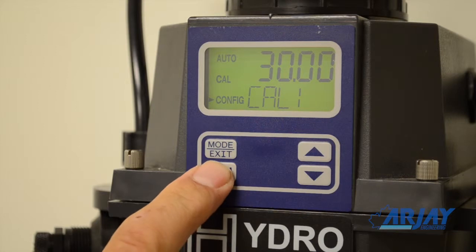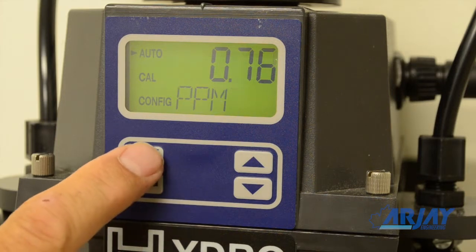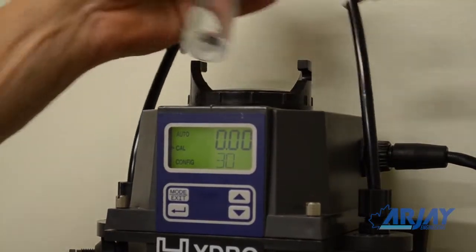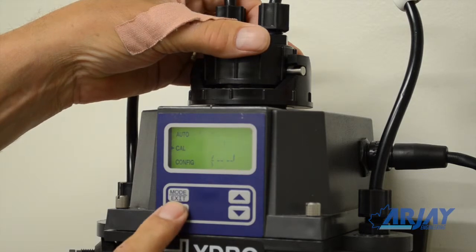First, determine what 2 or 3 ppm values are being used for calibration and enter these into the setup mode of the instrument. A 0 ppm reading can be one of the calibration points. With the calibration samples prepared, enter the calibration mode and proceed to the automatic calibration screen. Follow the prompts and enter the ppm value of the sample that will be inserted into the instrument.